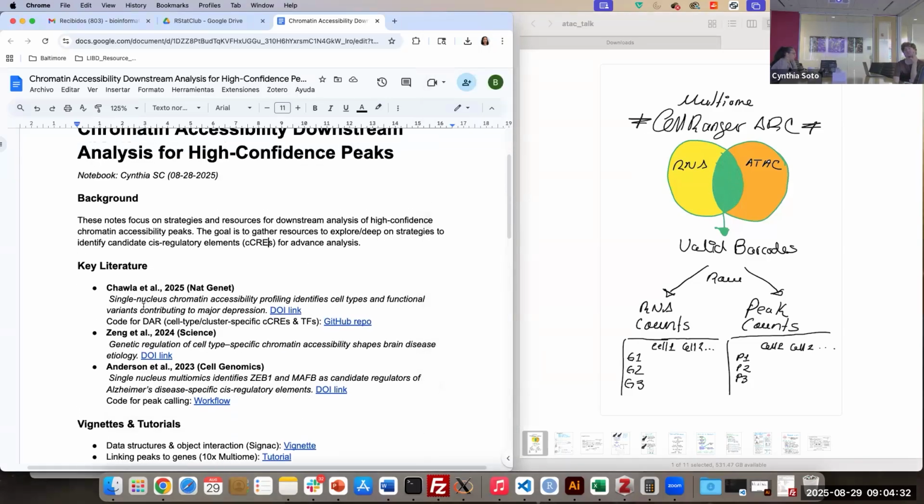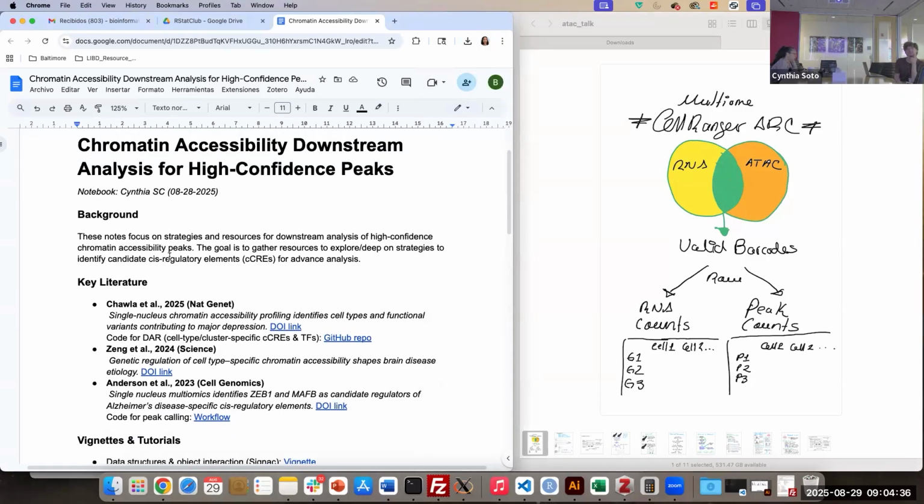analysis. So first of all, I'm going to share with you this document. In this document, I tried to gather most of the relevant topics that I have selected from different resources, because to be honest, I have found that this step, which is very relevant, is poorly documented or is very specific, so we cannot just take these pieces of code and try to reproduce a specific pipeline, because it is driven by specific goals.